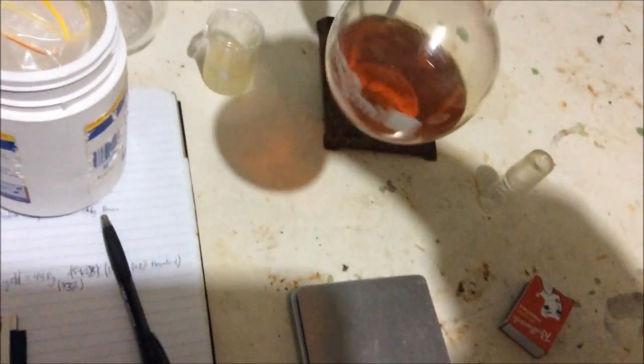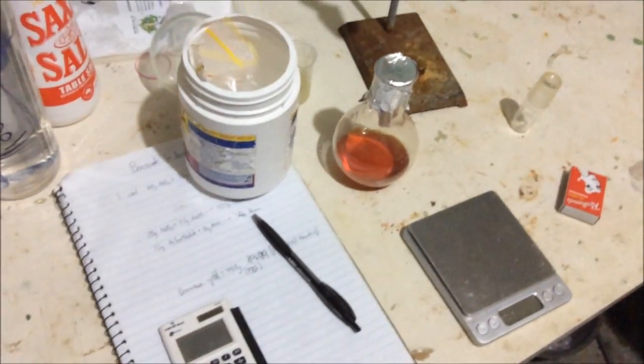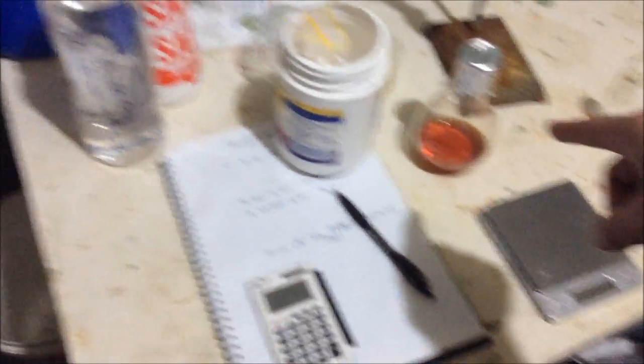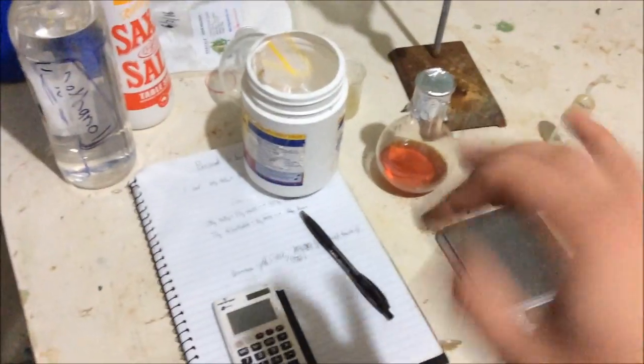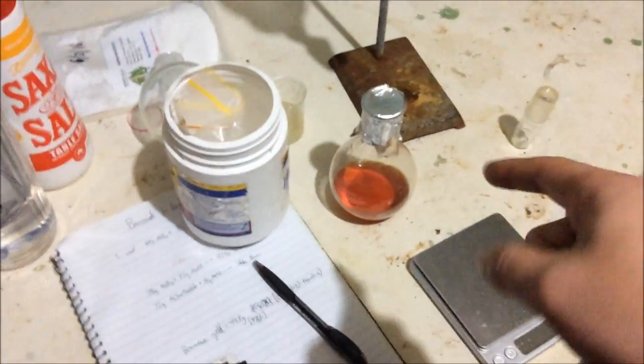Here is our orange benzene from the sodium benzoate dry distillation. You can see there's quite a bit there. Using 100 grams of sodium benzoate, if we assume this is 100% benzene — which it obviously isn't because there are some solids at the bottom — I got 44.8 grams, which corresponds to an 83% yield. But 83% is far too high for a dry distillation like this. After distillation it's going to be more like 50%, which is really good.